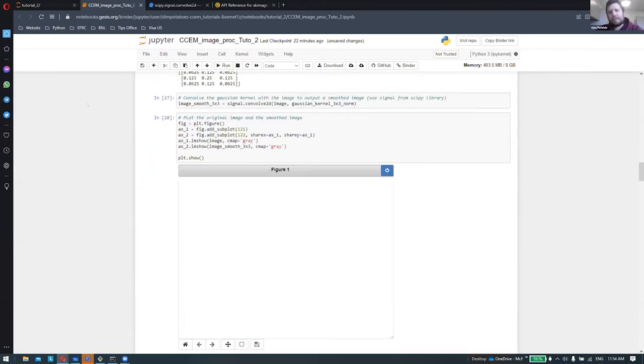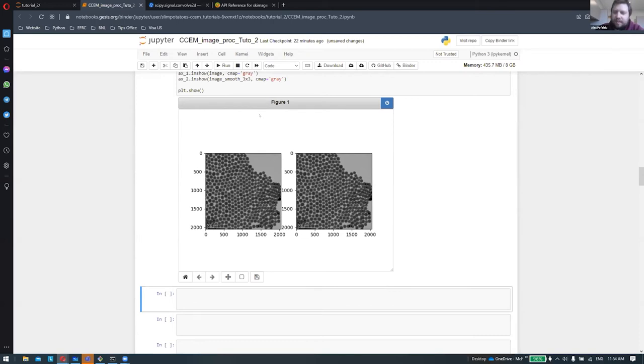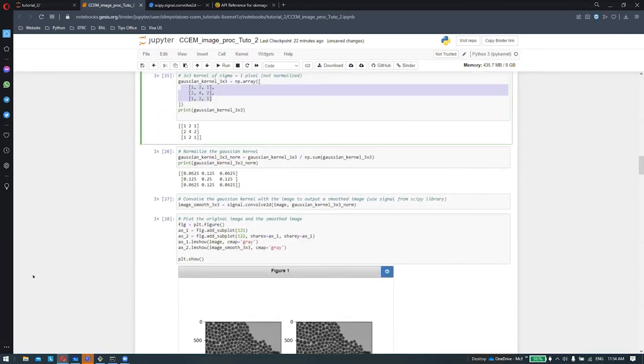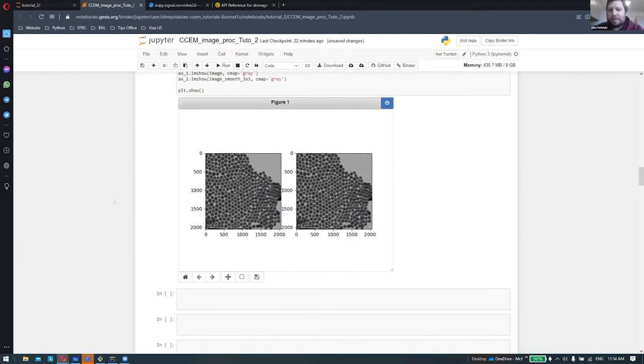In our original case. Oh, I think there is a question. Joao, you have a question or a comment? I just have a quick comment. I just want to stress that these are discrete approximations to the Gaussian function. Mathematically, the 3x3 or 5x5 is a very good approximation. But if you're dealing with mathematicians, they'll tell you that it's not the continuum kernel like the Gaussian function is. But these are the best approximations that we can apply to our matrix, to our 2D arrays. Keep going, Alex, doing great. Yeah, that's a very good comment.